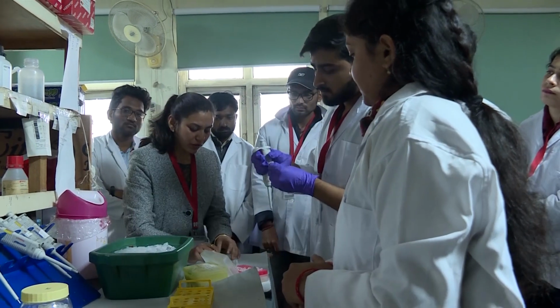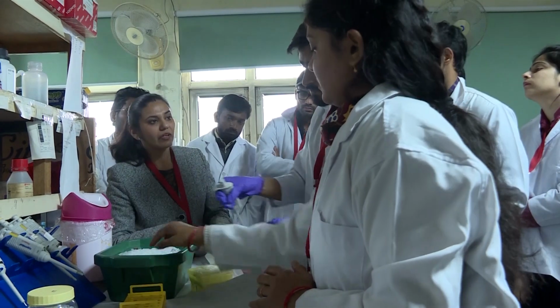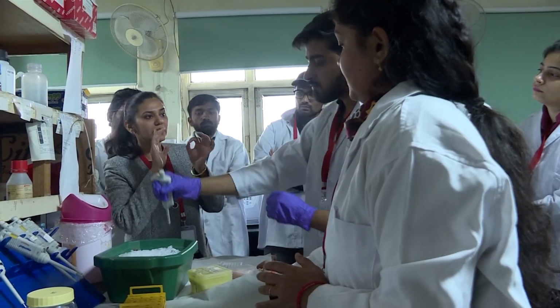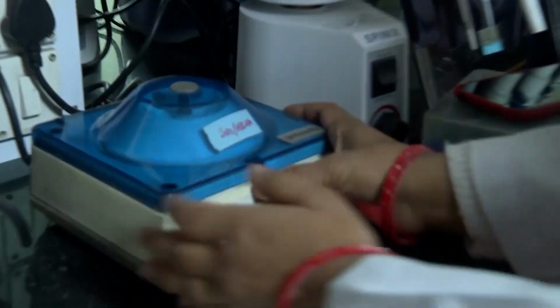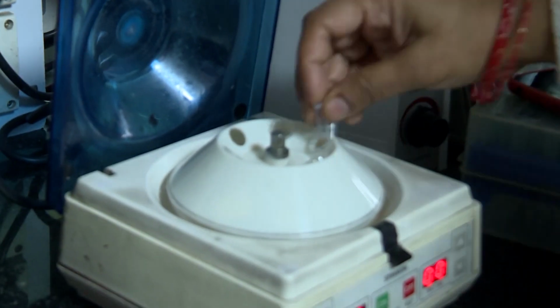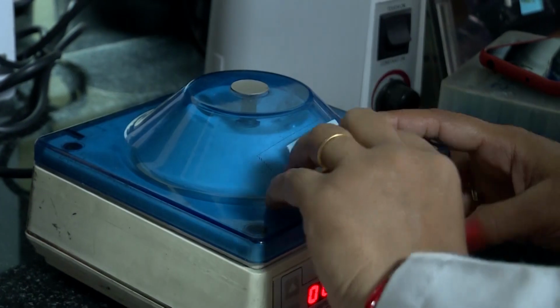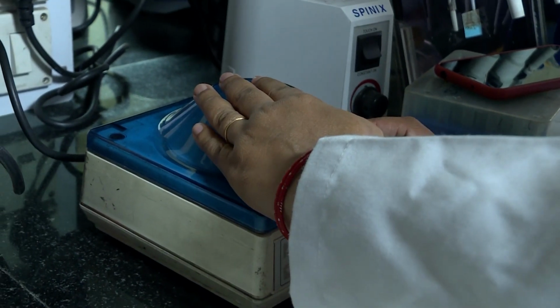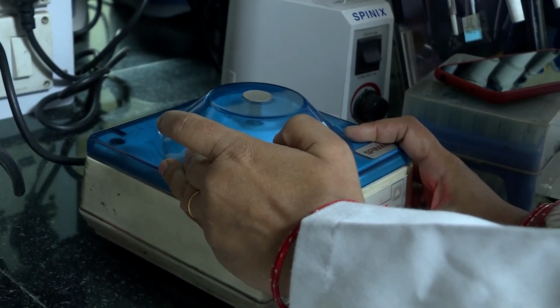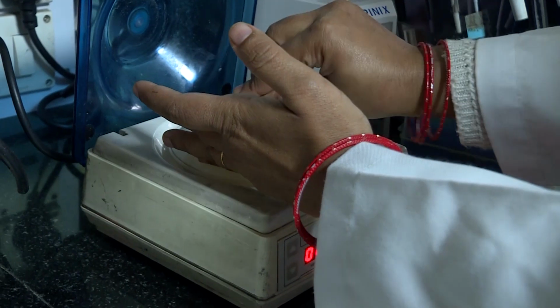Now all things are added. Now we require that all the components mix properly, so we can spin it. Now this is what we call the semi-skirted plate, 96 well plate. Always use only this type of plate. Okay, now here the reaction is prepared. Now we have to distribute it into the wells.